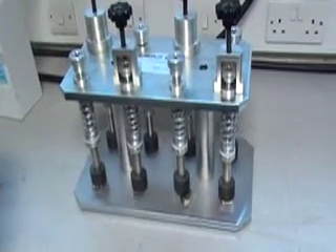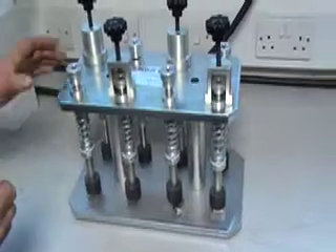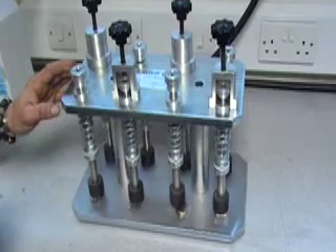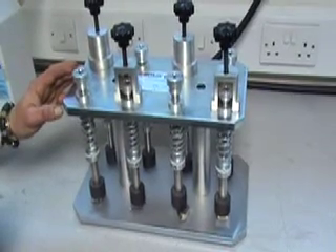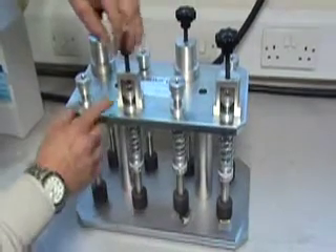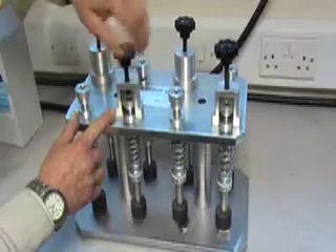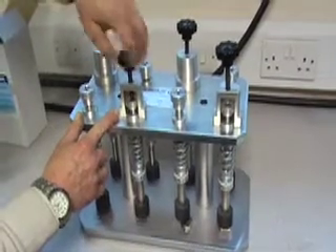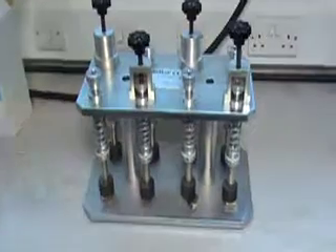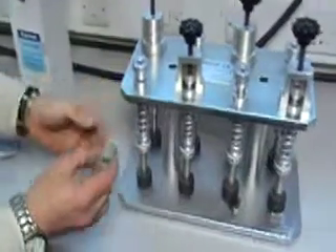Leave for approximately 10 to 12 hours. To increase the speed of the drying time of the resin, you can place on top of a hot plate to increase the pressure onto your rock sample. There are four stations with an adjuster to increase pressure. These samples have been prepared and dried for 12 hours.